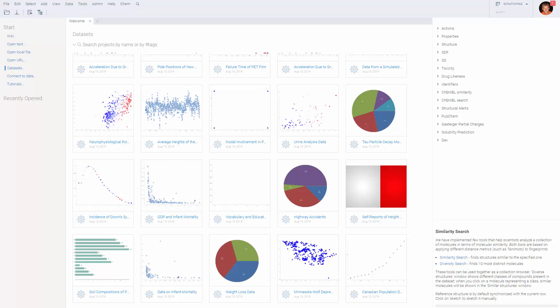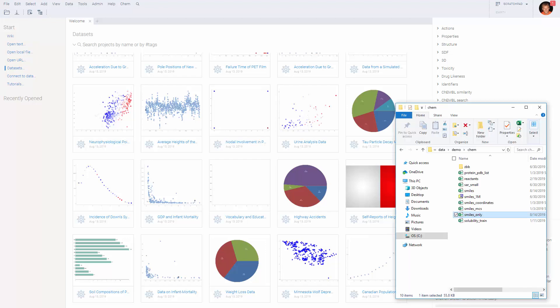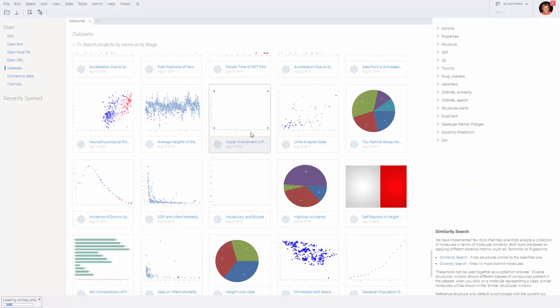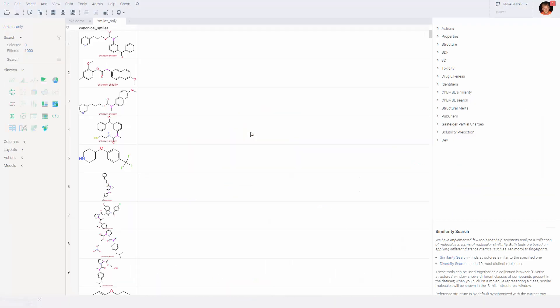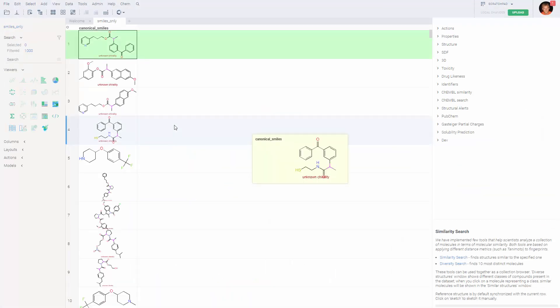In this video, we are going to learn how to use chemical similarity and diversity tools. Let's open our dataset first. It contains 1000 random molecules from the Campbell database.